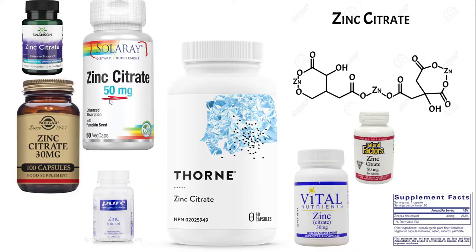You're also going to want to write down the number of milligrams per pill, which is typically one capsule serving size on the bottle, okay? These things can range from 30 milligrams, 15 milligrams, 10 milligrams. I don't really ever think I've seen anything over 50 though. But again, just double check them, write down what you're actually using.